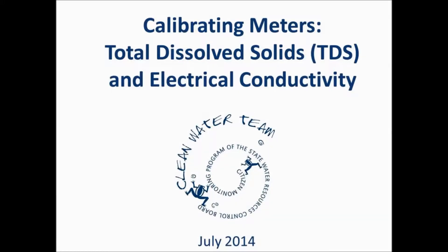Instruments that measure total dissolved solids are typically called TDS meters or conductivity meters. They measure the flow of electrical current between two metal posts within the probe. The more salts that are in the water, the higher the reading.